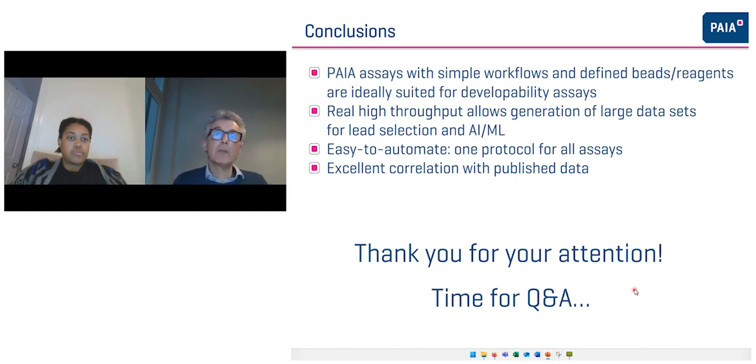The thing with the thresholds, we don't really like thresholding, right? Because this is kind of an arbitrary line that you're drawing somewhere. We want to have reproducible assays where you can really compare one-to-one the raw intensities that you see on a Monday, on a Friday also. So they are very reproducible, those assays, and we want to feed not flags into models, but real numbers, so quantitative data. I hope that's answering the question.